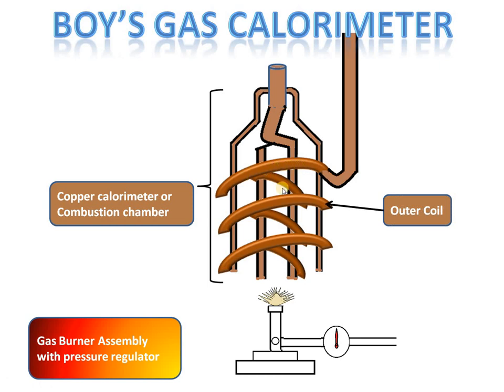This is the outer coil present with the combustion chamber, and another coiling is the inner coiling. These are the inner coils provided with the combustion chamber.